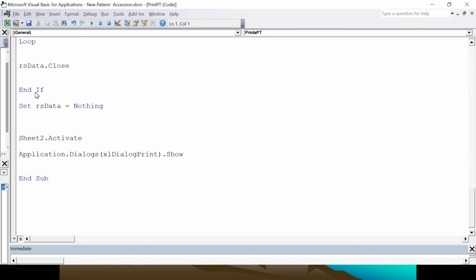At the end, if you fill all these fields, they automatically call the Windows print command. So you can see it shows up. You can either print or close this. So this is about the print label.